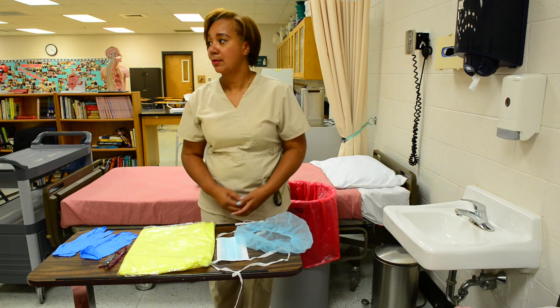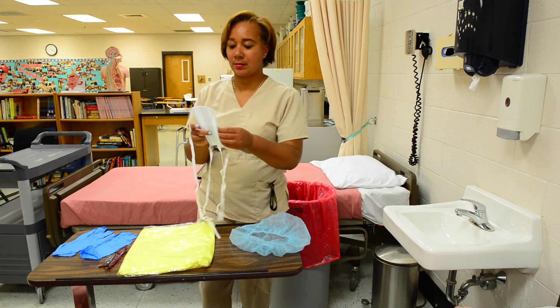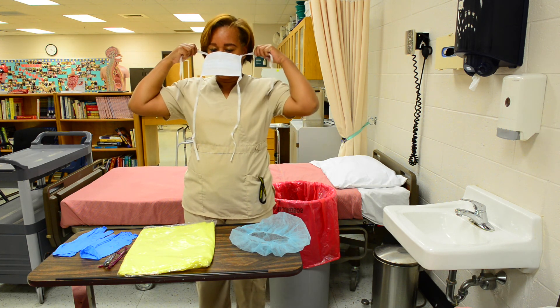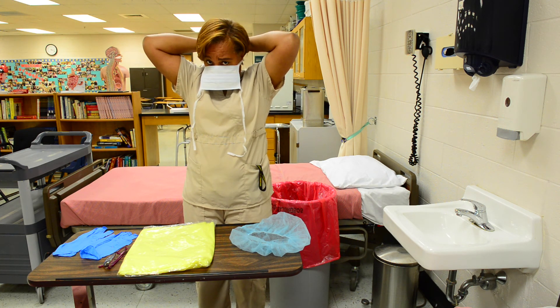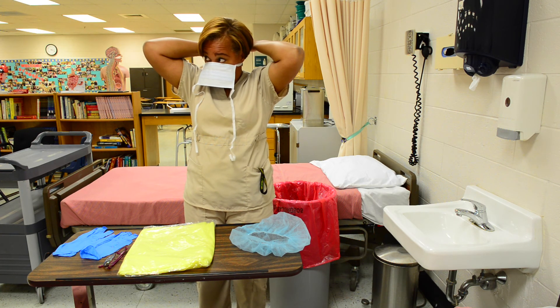First thing, apply the mask correctly, making sure that you've pinched the part of the mask that will go over your nose and make the mask secure.